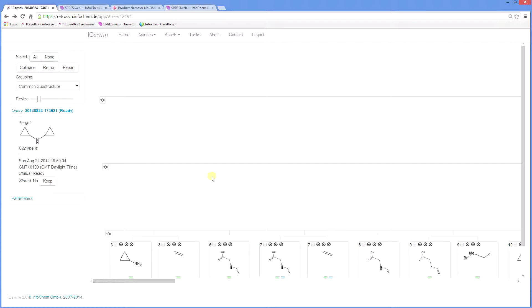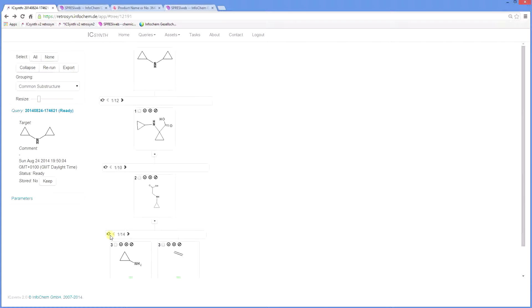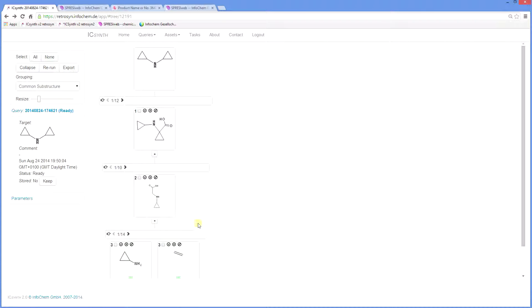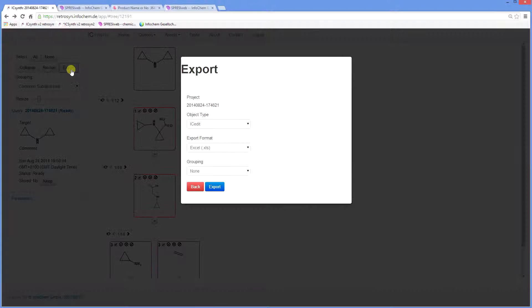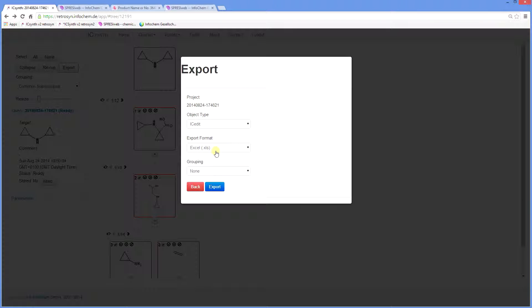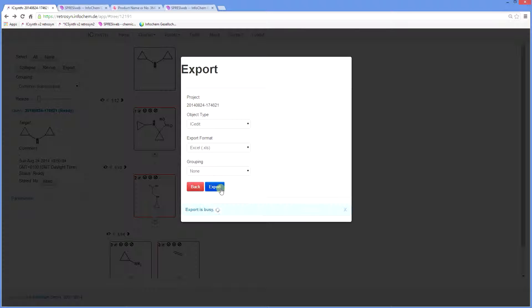Going back to the tree, having evaluated the suggestions, you can then select a specific pathway for export to Excel. For example, if I wish to choose this retrosynthetic pathway, click on the box next to the node number and the pathway is highlighted in red. I can then export this into Excel.